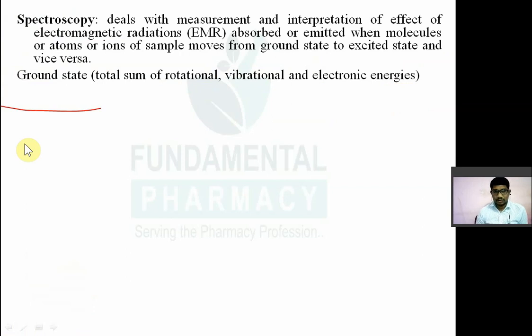So if that particular radiation has a particular wavelength, अभी वो radiation अगर UV range का है तो उसको बोलेंगे UV spectroscopy. अगर वो radiation infrared region का है तो उसको बोलेंगे infrared spectroscopy. अगर वही radiation X-ray region का है तो उसको बोलेंगे X-ray spectroscopy. अगर वही radiation microwave region का है तो उसको बोलेंगे microwave spectroscopy. तो like that उसमें भी बहुत सारा type आता है, emission है, absorption है. तो we will see it in upcoming slides.